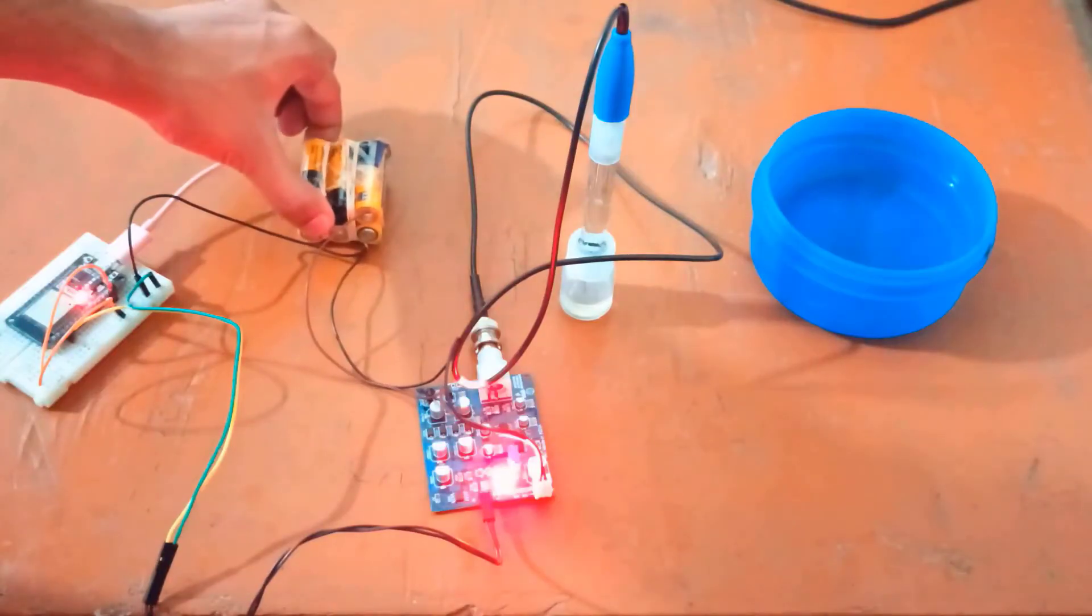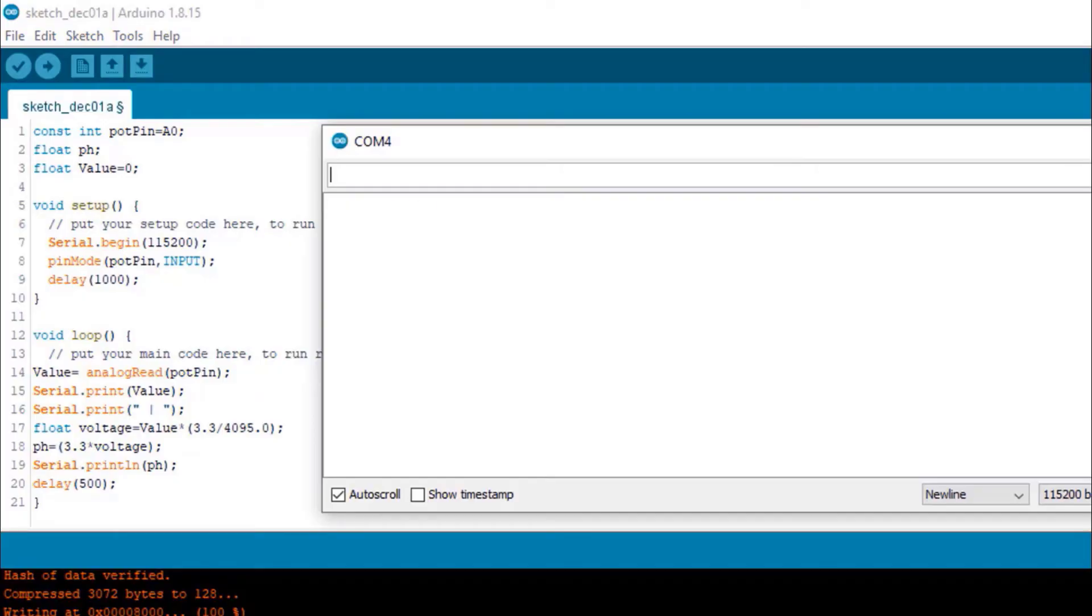After uploading the code, you can now open your serial monitor. Here we are getting the pH value around 4. This is the value you will get when the electrodes are dipped in a storage solution.